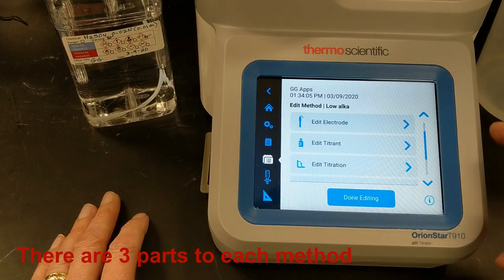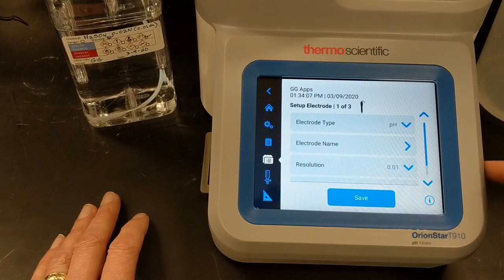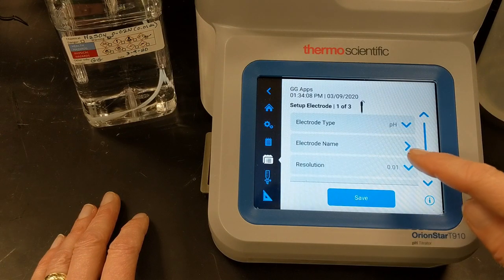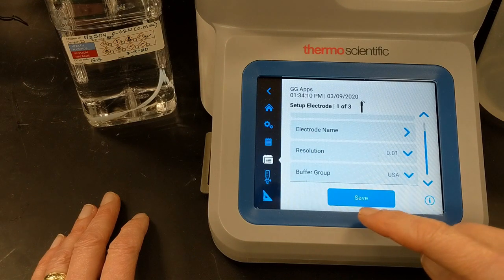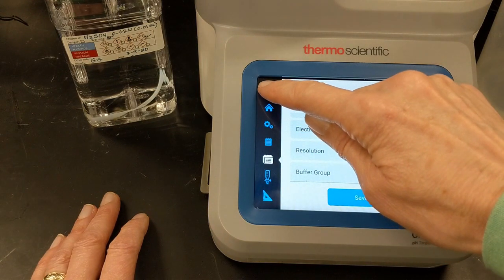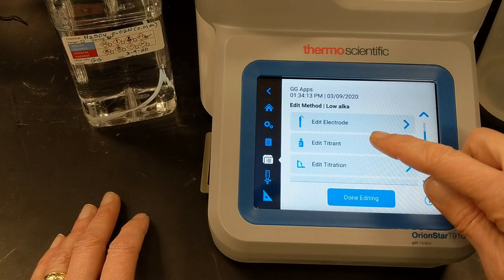From here, I can see that the method has three parts: the electrode setup, the titrant setup, and the titration setup. First, I'll view the electrode setup. I'm using a pH electrode, a resolution of 0.01 pH units, and the USA buffer group. I touch the back icon to see the edit method screen, and then I'll view the titrant setup.